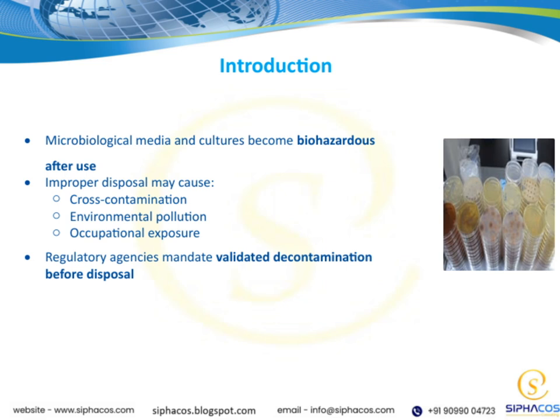That's why regulatory agencies require that all biohazardous waste be validated and properly decontaminated before disposal. This step is crucial to protect public health, the environment, and everyone involved in the process. So, adhering to these guidelines is not just about compliance. It's about safety and responsibility.